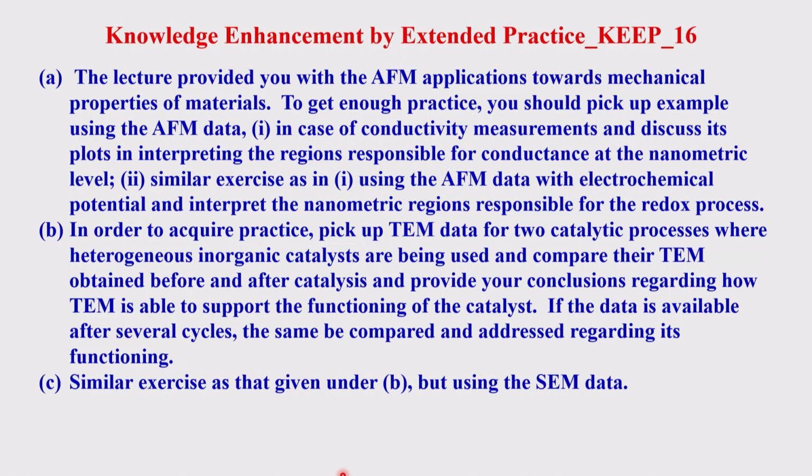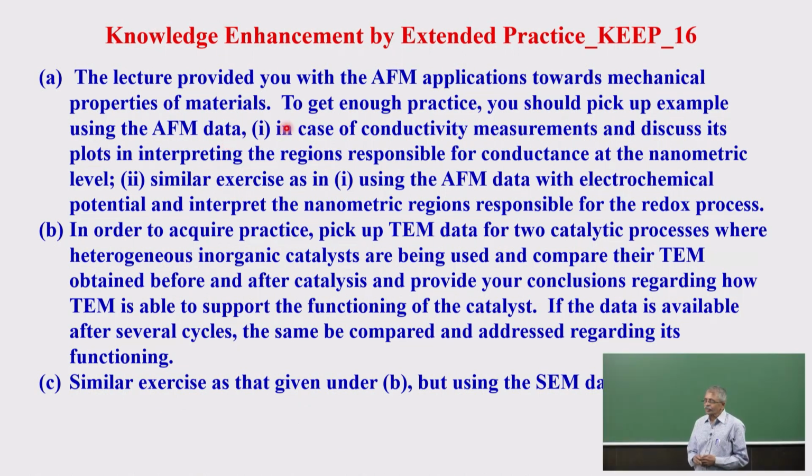In the lectures I have provided the AFM application towards mechanical properties, but this AFM can be used for conductive force, conductivity, and electric properties like redox potentials, etc. So I would like to recommend that you get practice, that you should pick up some examples using the AFM data. One, in the case of conductivity measurements, and discuss its plots, interpreting the regions responsible for the conductance.